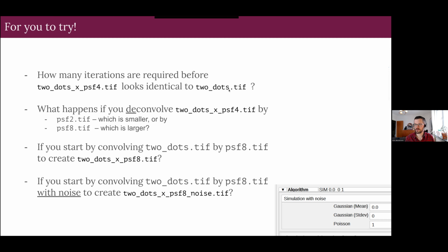You could try a little more. I picked a very tiny 2D image, so you should be able to do at least 1,000 iterations even on a laptop, I think. Number 2, if you deconvolve this image you generated by the wrong PSF, a PSF that is smaller or larger, what happens in that case?